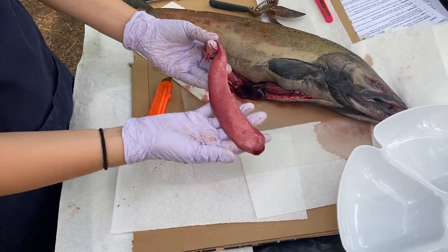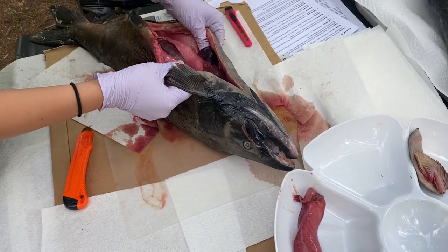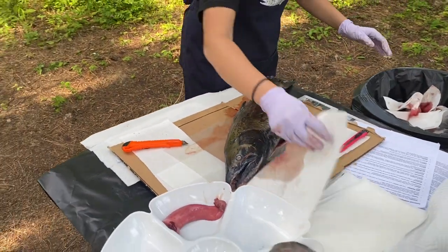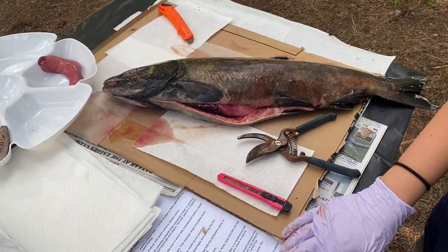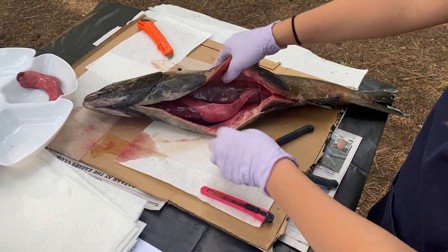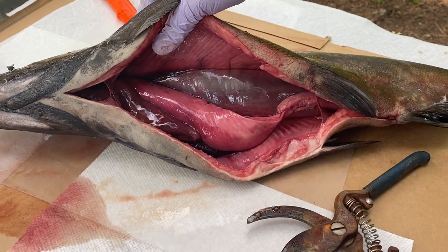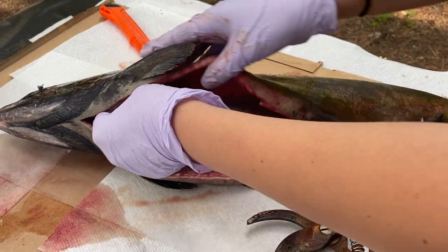So these are the salmon's reproductive organs. He has one on each side of him. So we can turn him over. Let's give him a flip around. And we can see his other one. But on top of it, I want you guys to see this here. This really large red structure is the salmon's liver. And the liver is the largest organ inside the salmon.